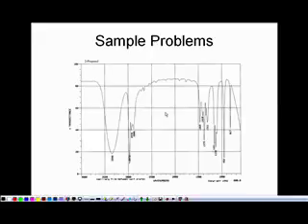So what I do is I read the spectrum from left to right. I'll look for OHs, I'll look above 3000 for alkenes and aromatic systems. I'll look below 3000, but I'm not surprised if there's peaks there because it's an alkane. And then I'll look for carbonyls. I'll just take an inventory of what functional groups are there. And this molecule is 2-propanol, that's isopropanol. So it's CH3, CHOH, and then CH3.